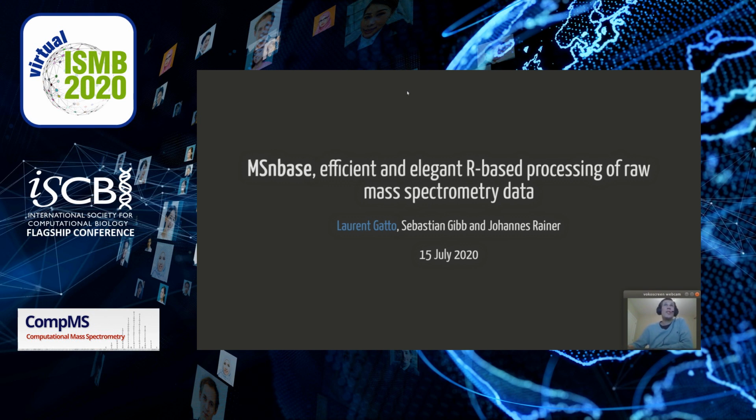Today I'll be presenting how the latest version of the MSnbase package can be used to efficiently handle raw mass spectrometry data. So let me start by providing a little bit of background about the software.